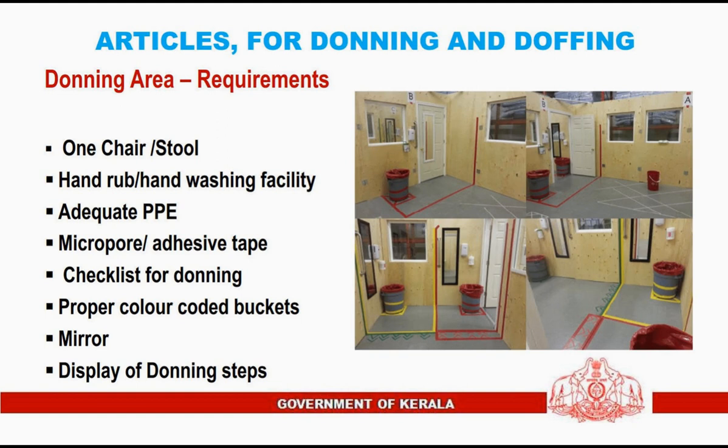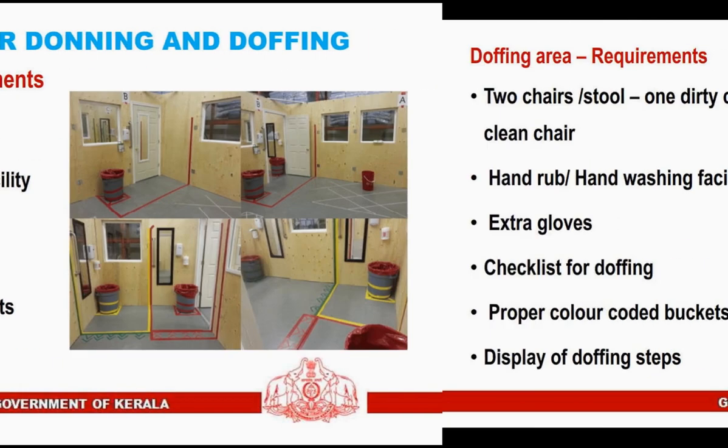Articles for donning and doffing. Donning area requirements: 1 chair or stool, hand rub or hand washing facility, adequate PPE, micropore or adhesive tape, checklist for donning, proper color-coded buckets, mirror, and display of donning steps.